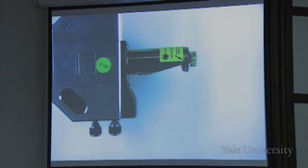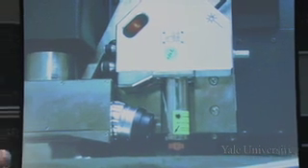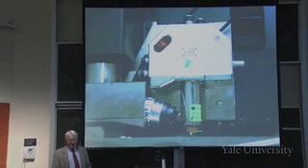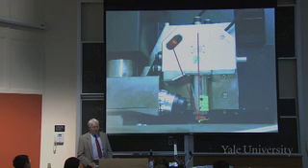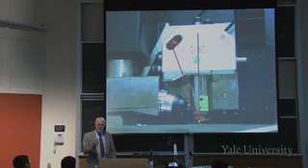So here's that thing mounted in an instrument, and you see there's a red light glowing in the glass. And the reason is it's being irradiated by, so there's a blown up picture of one of these tips pointing down. And laser light comes and bounces off the shiny gold on this tip and gets reflected up to a detector. Now, what would happen if you pushed up on the tip?